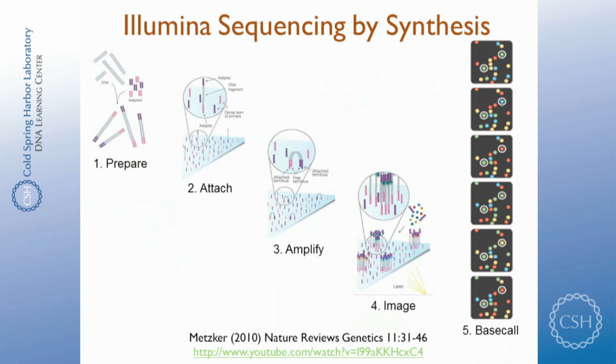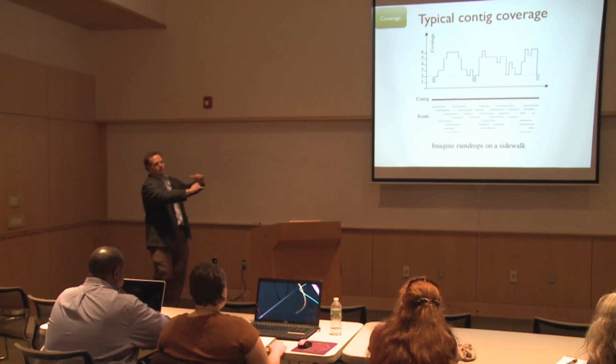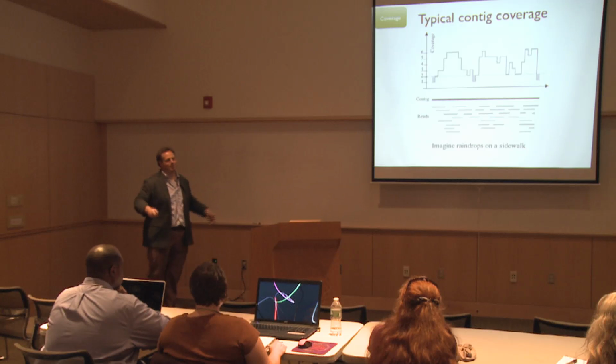The most tractable parameter to control in a sequencing project is how much sequencing to do. In practice, do I do 1 lane? Do I do 2 lanes? Do I do 10 lanes? How much should I do here? Again, because it's a randomized process, conceptually what you would want is just enough such that the reads will perfectly lay across my chromosomes.